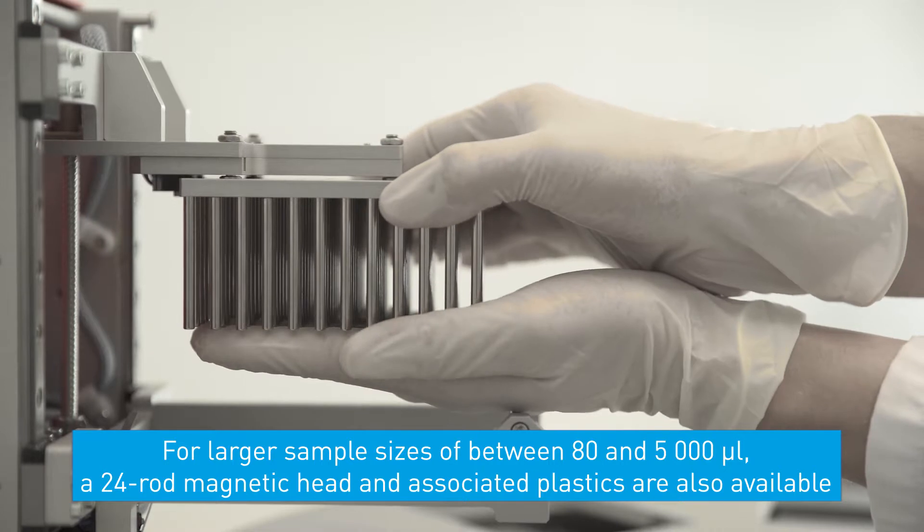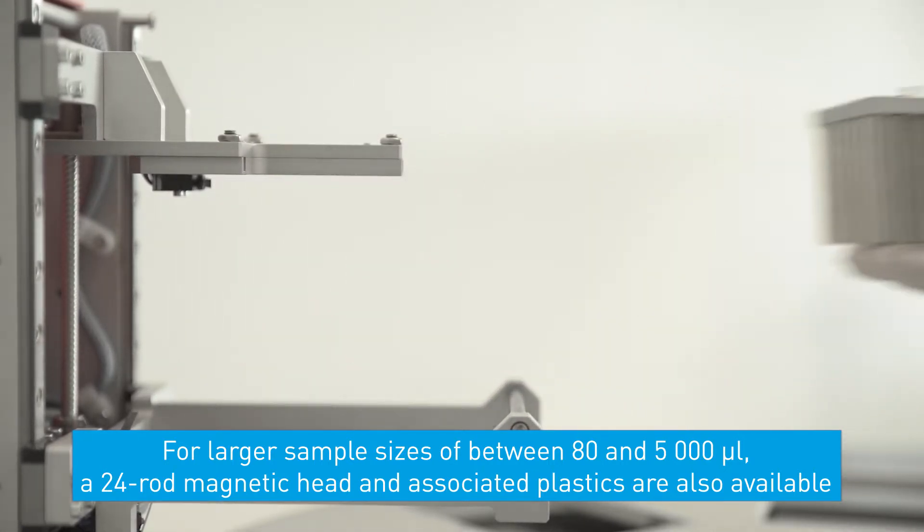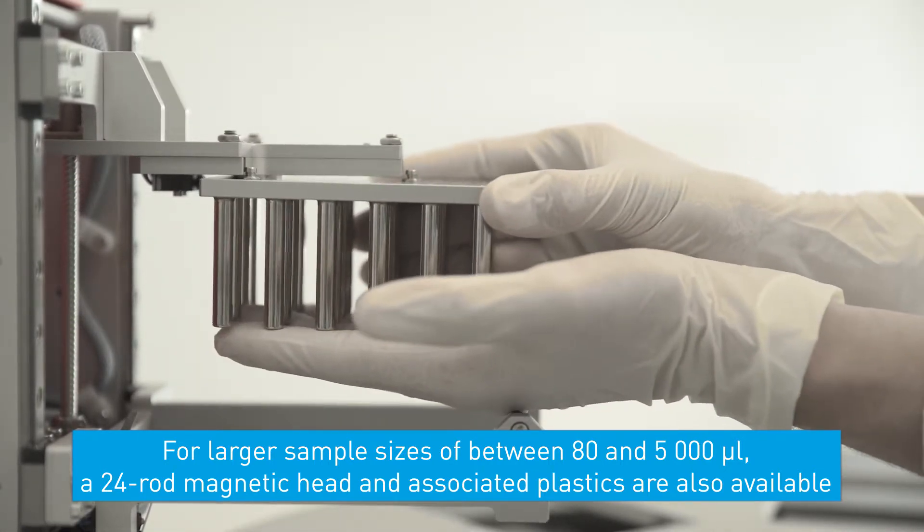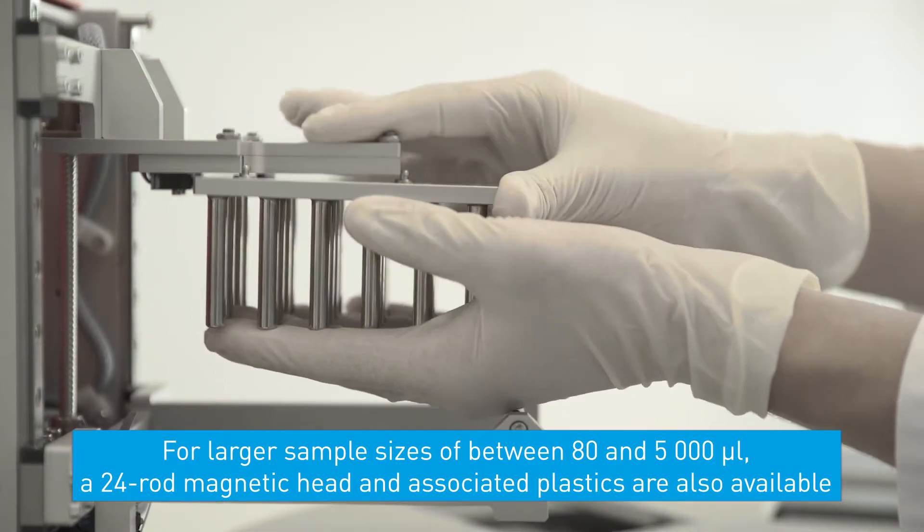For larger sample sizes of between 80 microliters and 5 milliliters, a 24 rod magnetic head and associated plastics are also available.